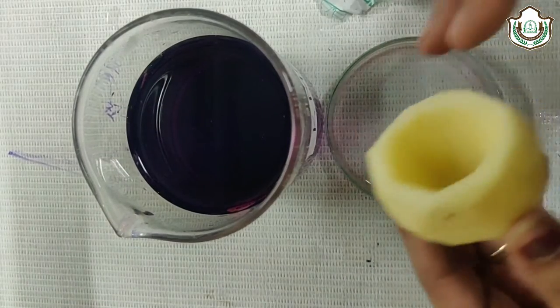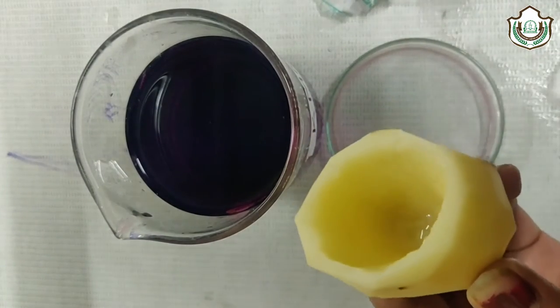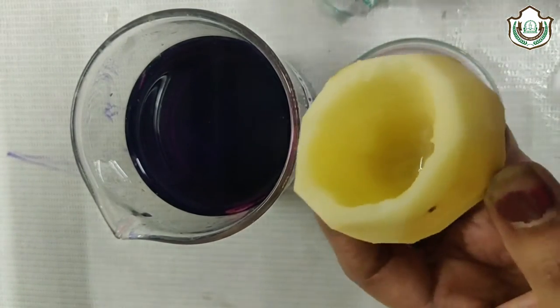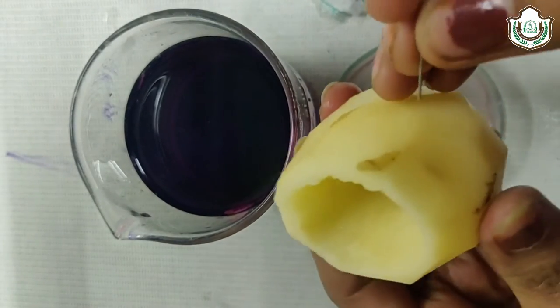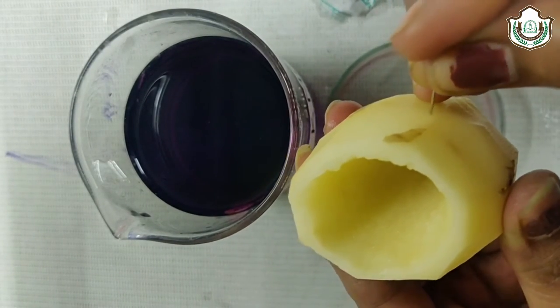Now our potato osmometer is ready. Now with the help of oil pen, we will mark the level of sucrose.